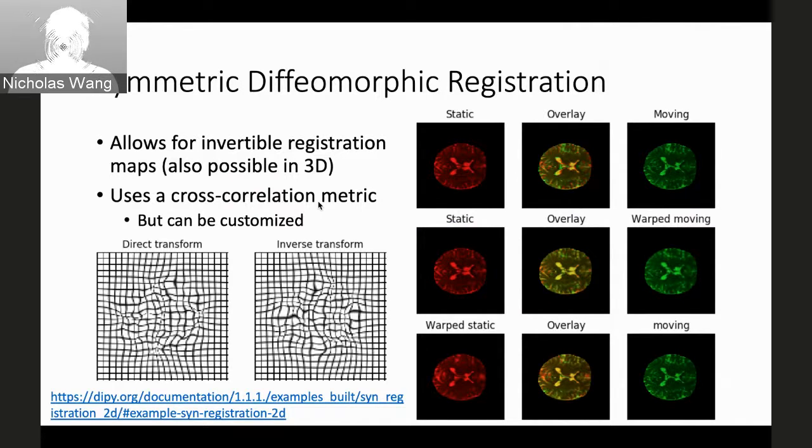And to be honest, I think it's helpful. For these kinds of image mapping, even if you did want to do a non-rigid registration, I would also make sure you align them first in the rigid sense. Because the further you have to move it, the more pressure you're putting on the system. So you can always do this in sequential steps and do an affine transformation first.